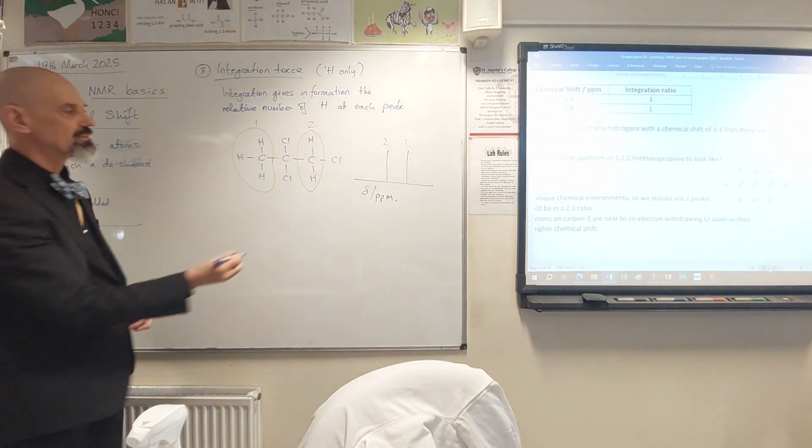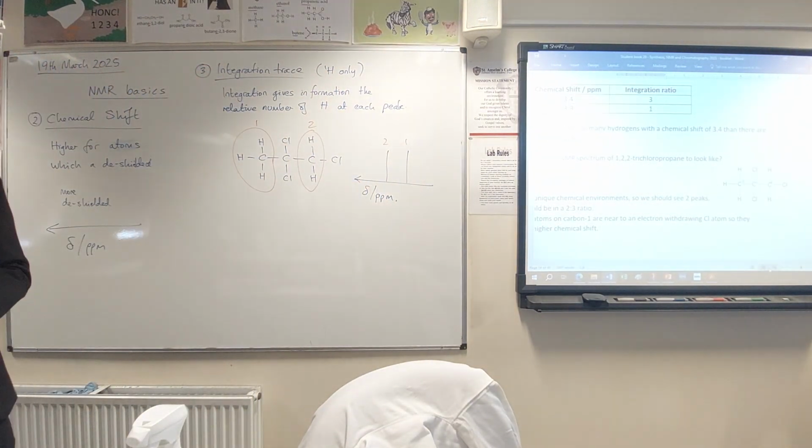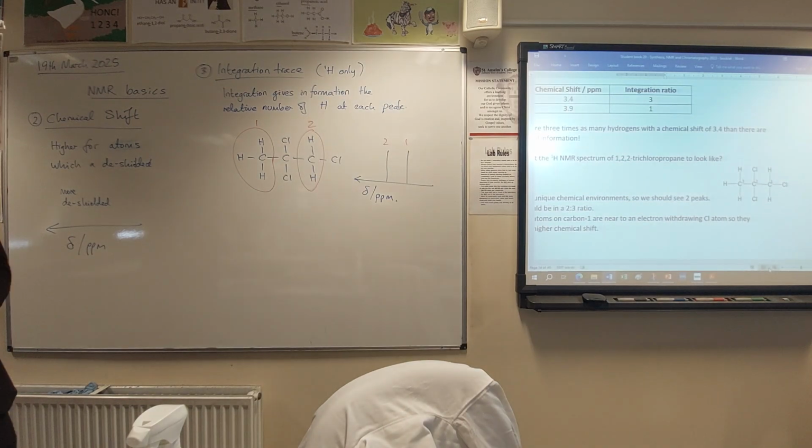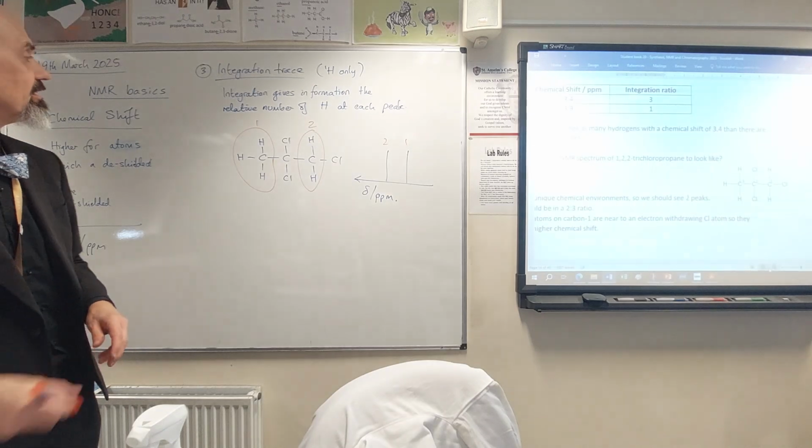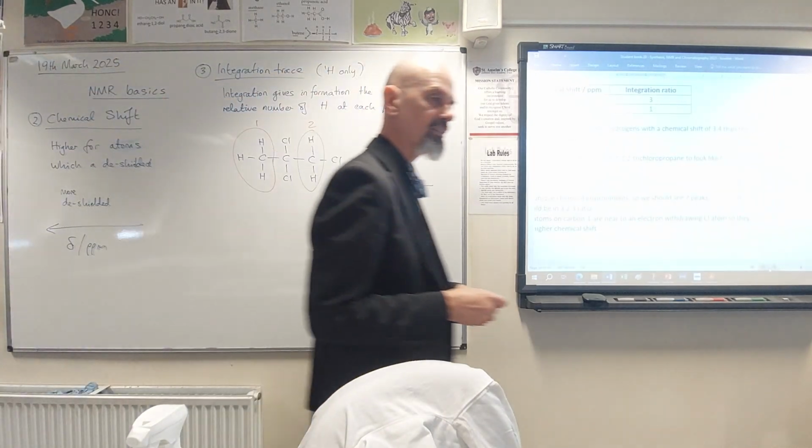chemical shift scale. And then in terms of the integration trace, the ratio would be, I'll use a different colour for that.